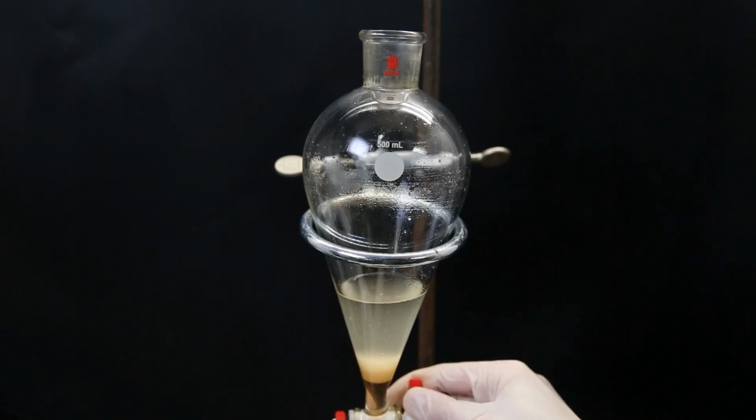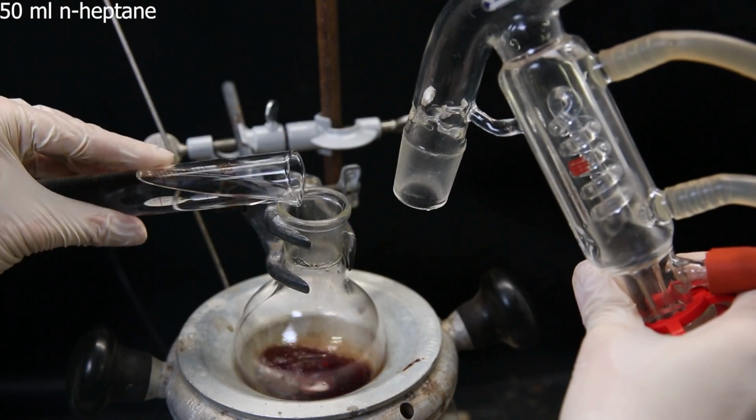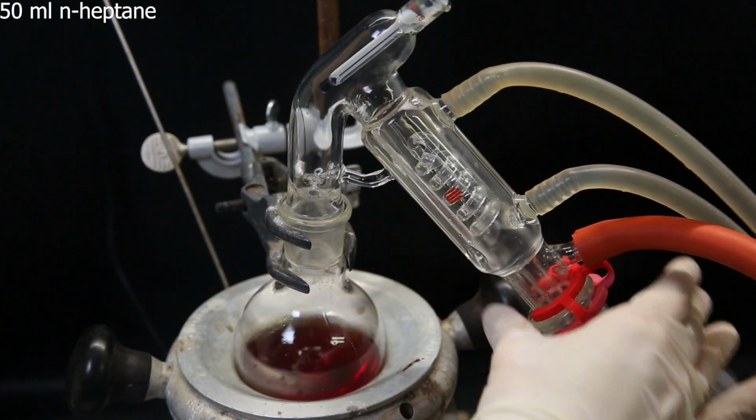Now I take the combined organic layers and concentrate it with short path vacuum distillation. When very little of the solution is left, I add 50 ml of heptane, which will help in azeotropically removing all the DCM.